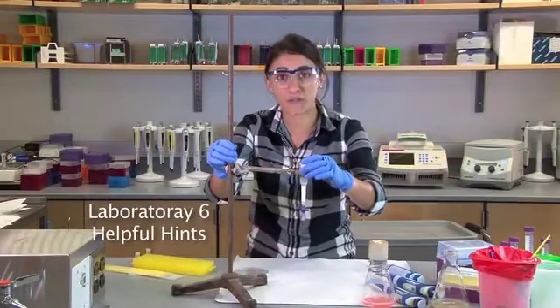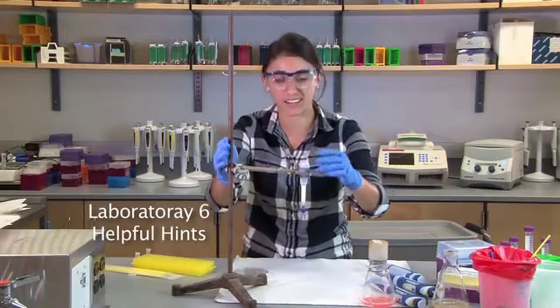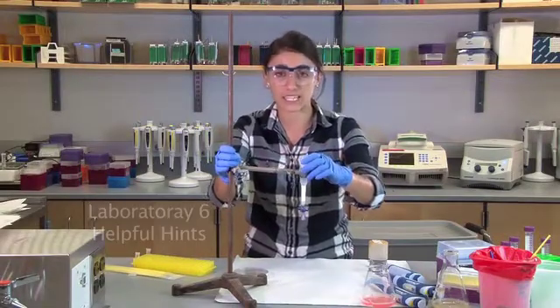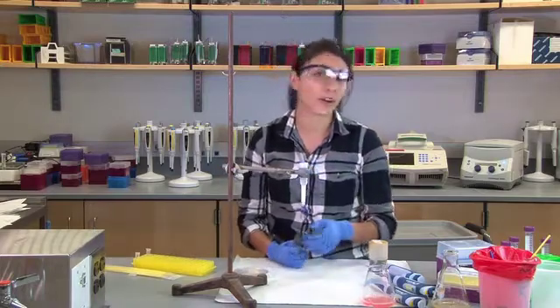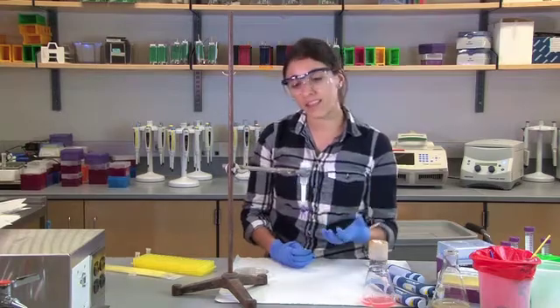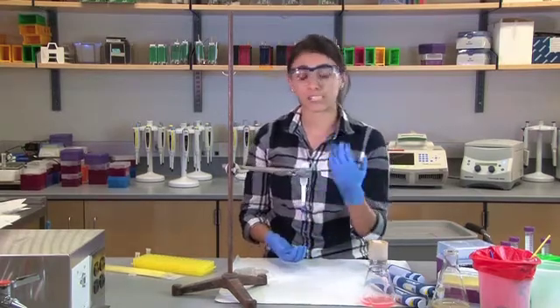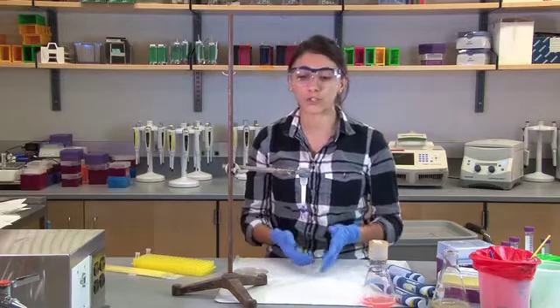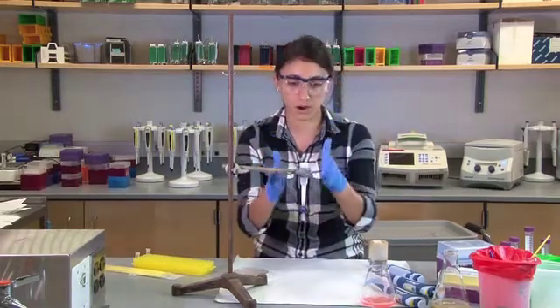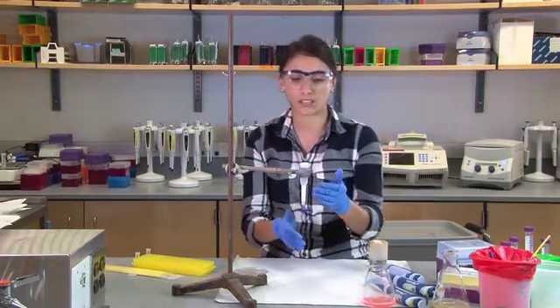Let's talk about helpful hints, the good, the bad, the ugly regarding laboratory six. So these columns, even though they're made out of plastic, they're incredibly delicate. So as I mentioned, you may get them either dehydrated or they may be tipped over. So it's really important for your students to make sure that their columns are upright and that they're hydrated.